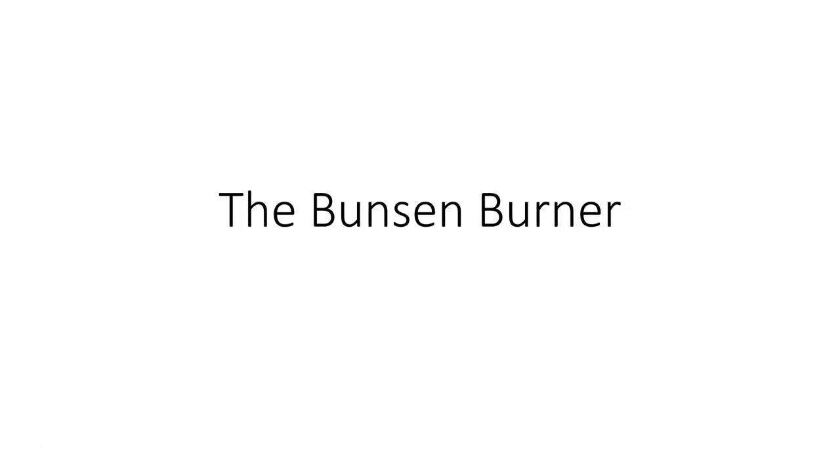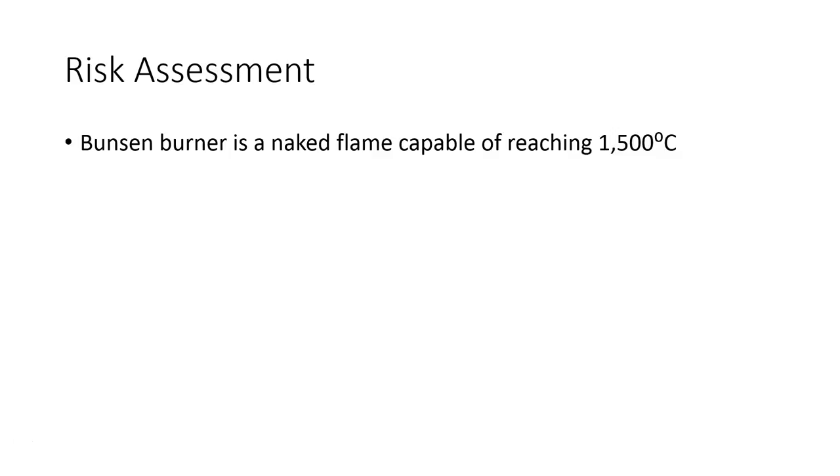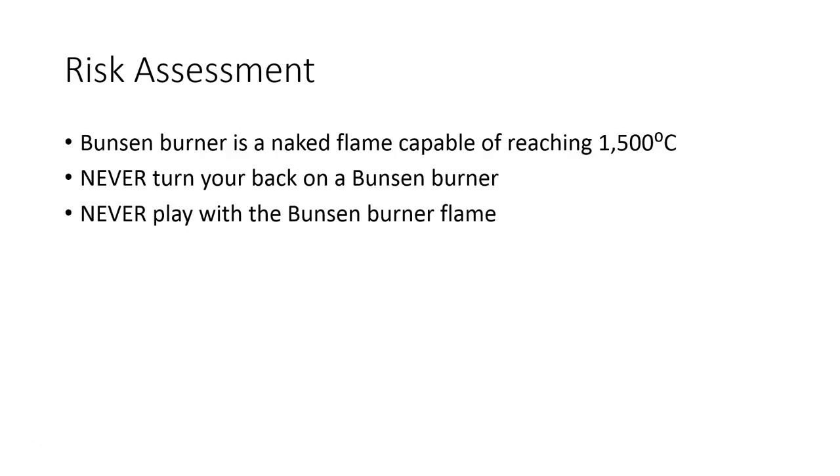Let's start with risk assessment. The Bunsen burner is a naked flame that is capable of reaching 1500 degrees Celsius. Therefore, you must never ever turn your back on a Bunsen burner, and you must never ever play with the Bunsen burner flame.